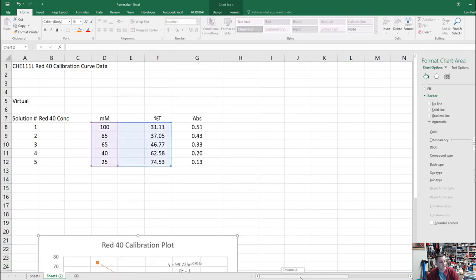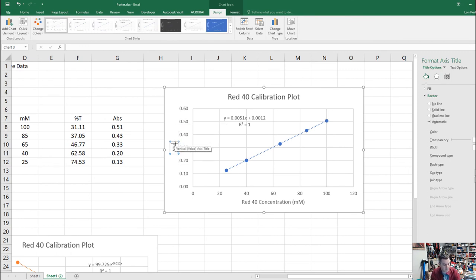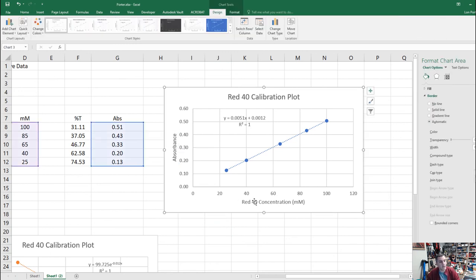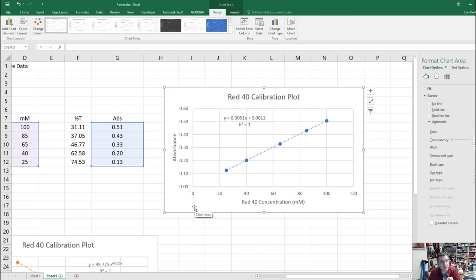More importantly, generate the absorbance versus concentration plot. Concentration is your independent variable on the x-axis; absorbance is the dependent variable on the y-axis. This plot is linear — you'll see a linear regression with equation y = mx + b. Note that the x-axis is in millimolar; you can convert to molar by dividing by 1000 if needed. You should generate both plots, which should look very similar to your pre-lab Excel file, and submit the Excel file with your lab notebook.